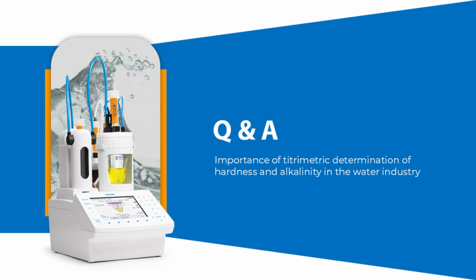There are multiple sources of error in the determination by using the titrimetric analysis. The most important factor is the weight transfer or sample transfer during the analysis. You have to take care that the complete sample is getting transferred for the titration. This can be the main reason for errors caused during the titrimetric analysis.